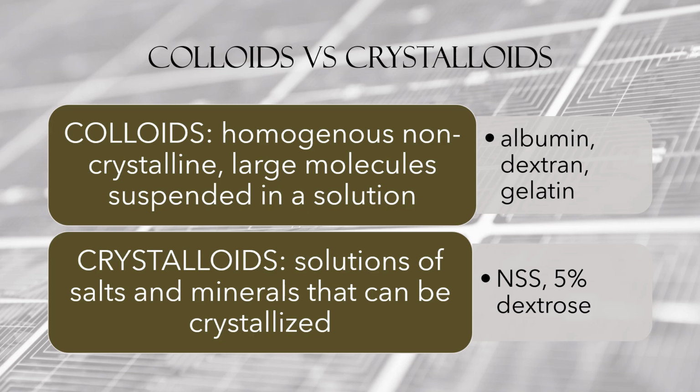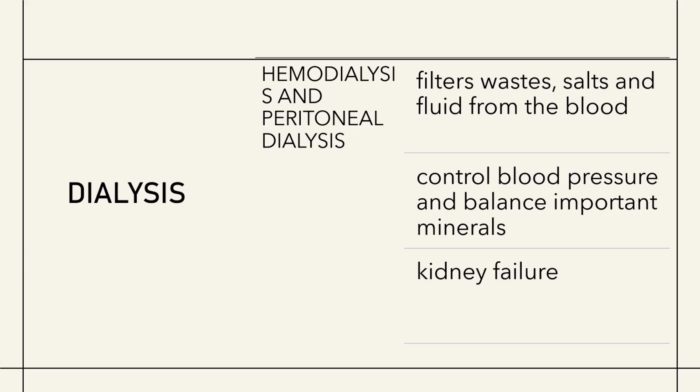Answering the question in your activity: what is the colloid utilized in the activity? You have the starch solution. What is the crystalloid utilized in the activity? You have your sodium chloride solution. And then let's move on to your dialysis.